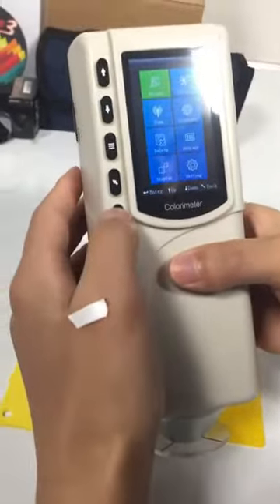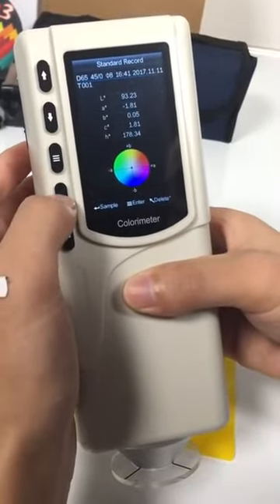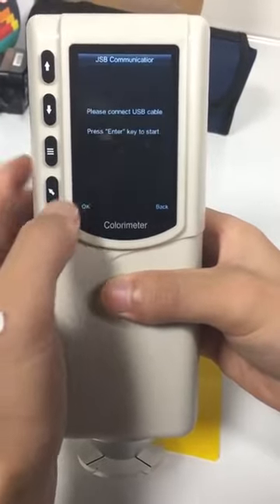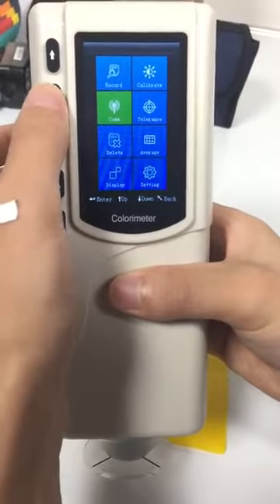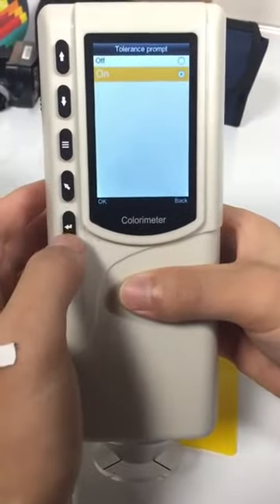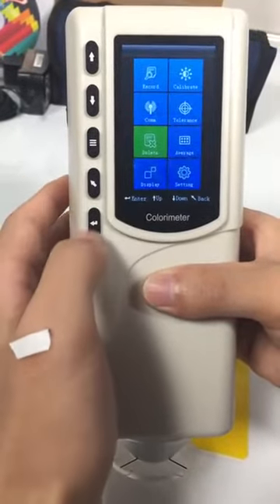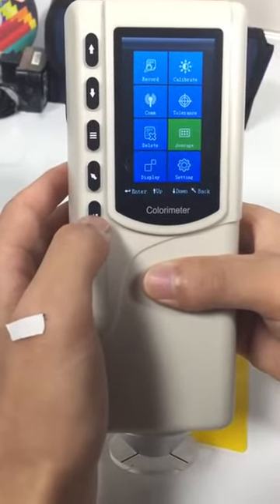Let's check the menu interface. Records — you can check the standards. Calibrate — for calibration. Com — for connecting with a computer. Tolerance — you can turn the tolerance prompt here. Delete — for deleting records. Average — for setting the average measurement.